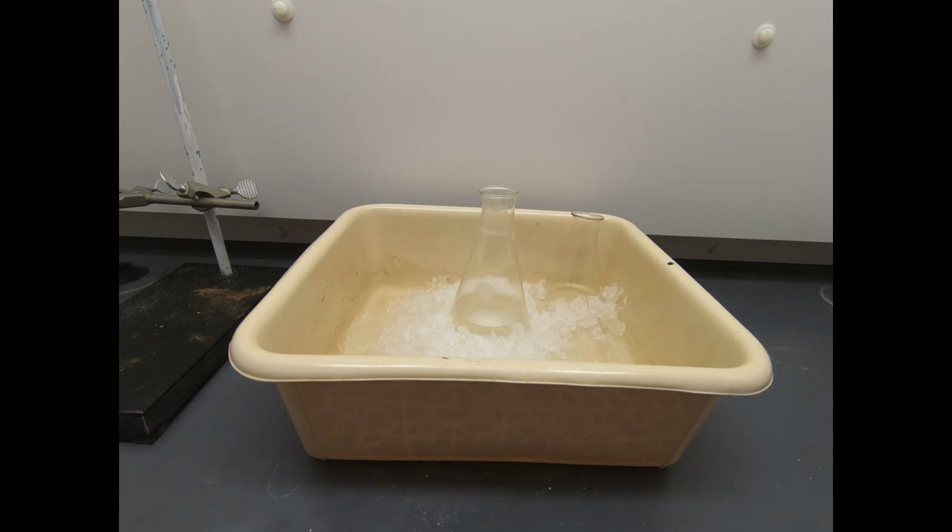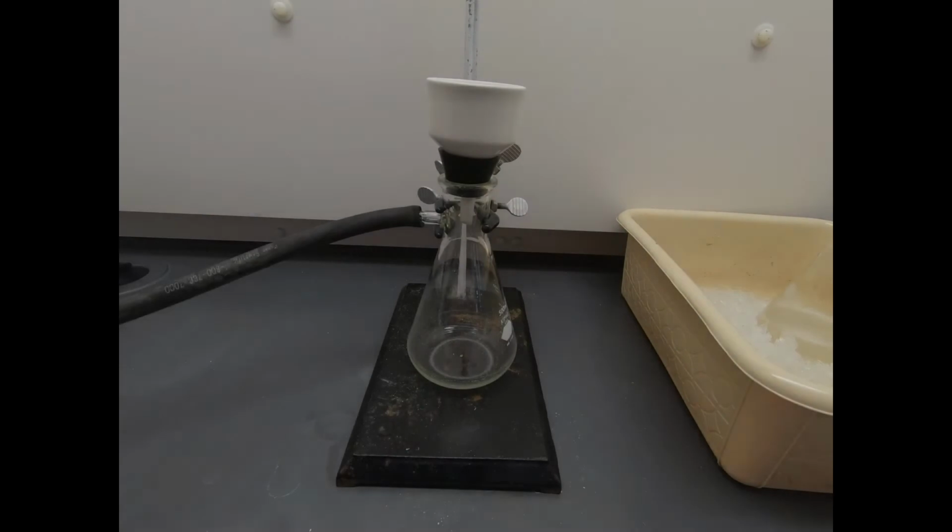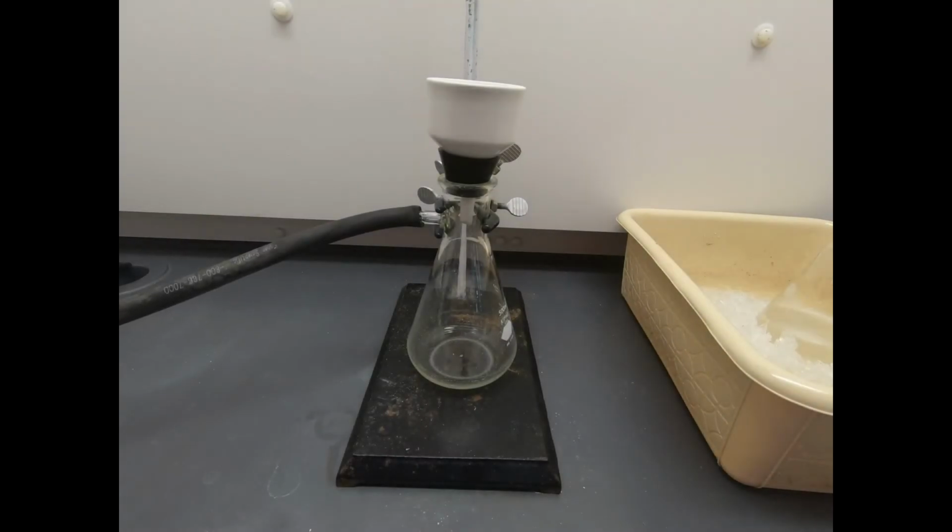So this is going to keep cooling for a little bit, and now we need to get set up for our filtration, because I think we've seen, maybe not all the product we will, but the returns are diminishing as we wait longer. So let's go ahead and get the filtration set up. So great, here is our setup.